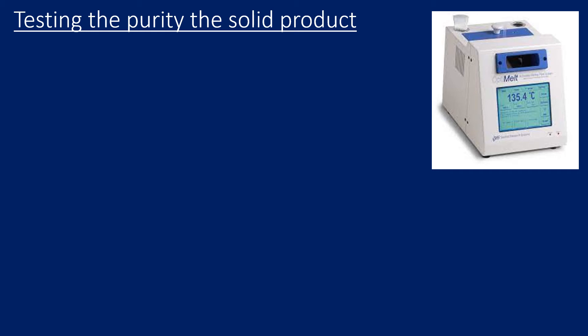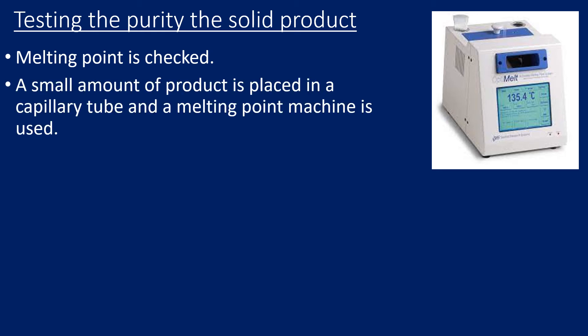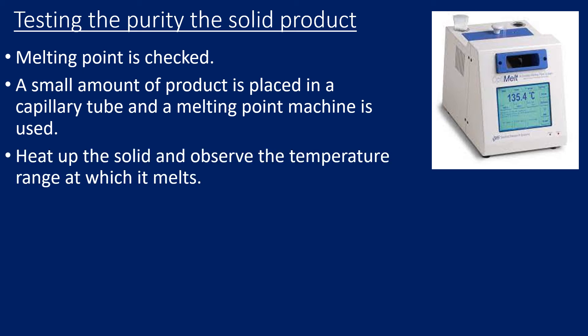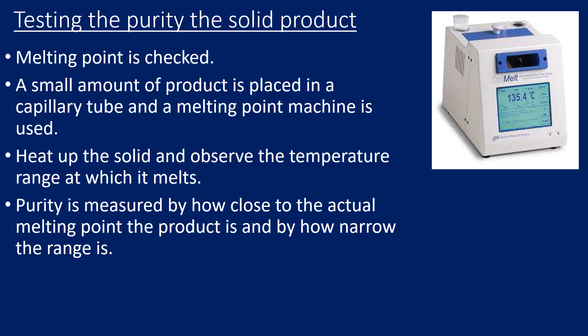We're going to test the purity of our product, and this is done by checking the melting point. We do this by putting a small amount of product in a glass capillary tube and then inside a melting point machine, which heats it up. We observe the temperature at which it begins to melt and the temperature at which it's fully melted — this is called the melting point range. A pure substance will have an exact melting point and a very narrow range, probably only within a couple of degrees, whereas an impure product might have a larger range and a value that does not match the textbook melting point.